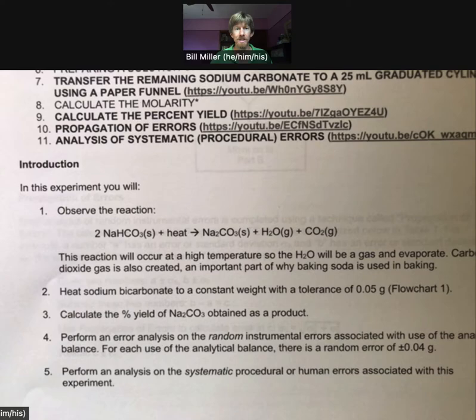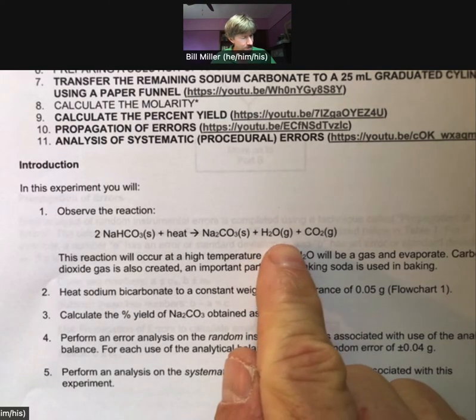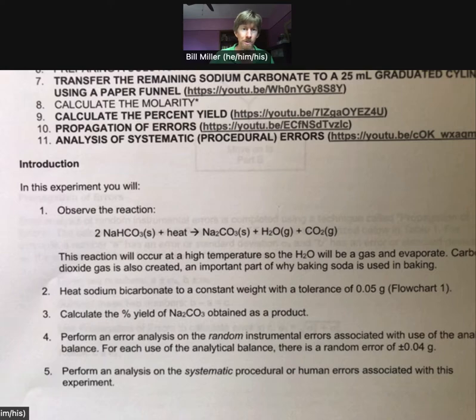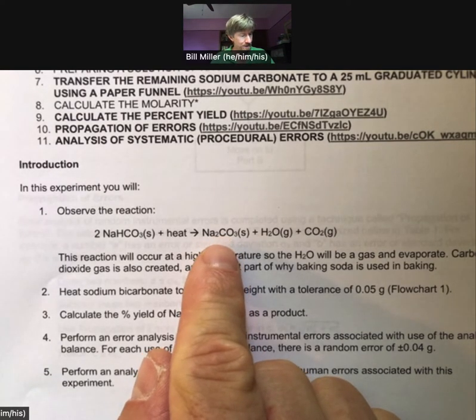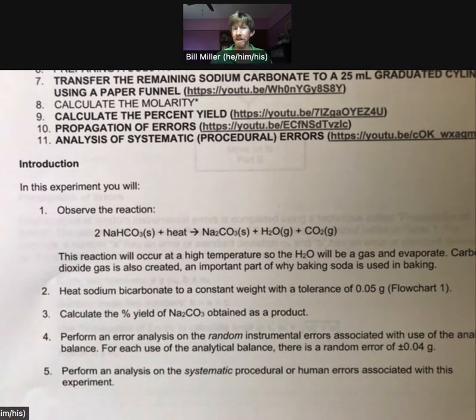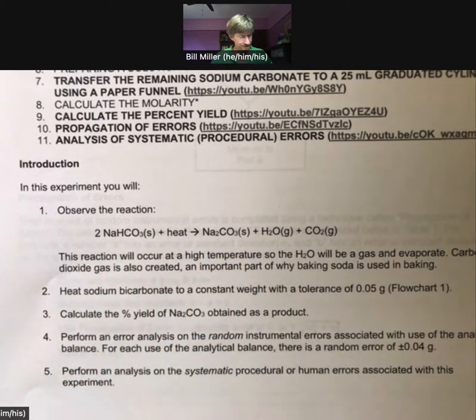And in fact, one of the questions may ask you about if you figure out the mass change. And that will be the mass of the H2O and the CO2 together. And you can actually calculate a molar mass of these two gases together and do stoichiometry with that. For the main part of the lab, though, we're going to be creating sodium carbonate. And from the mass of sodium carbonate, we'll be able to back calculate how much sodium bicarbonate we must have started with, and vice versa. Let's go ahead and put it in the oven, and we'll take a little break here while that happens.